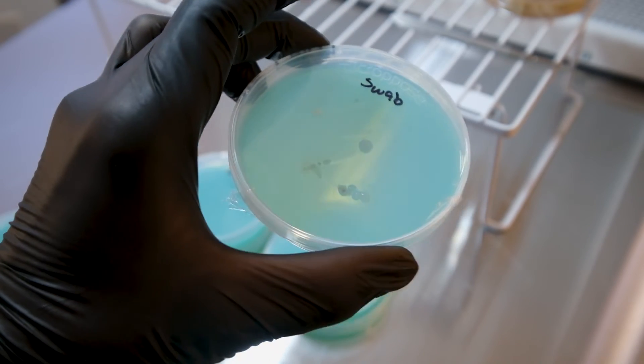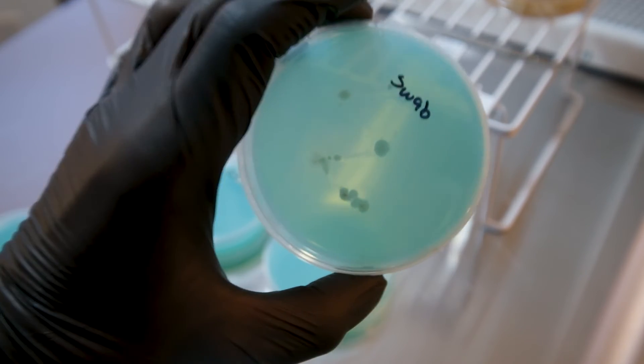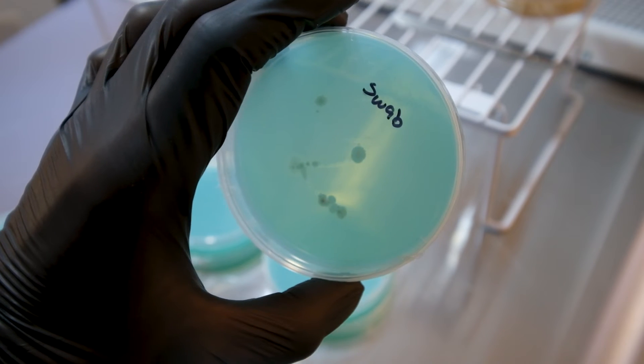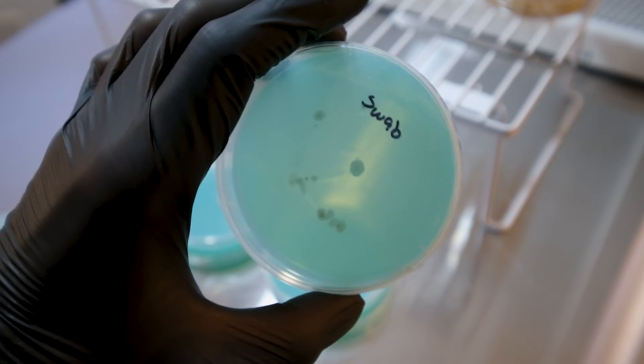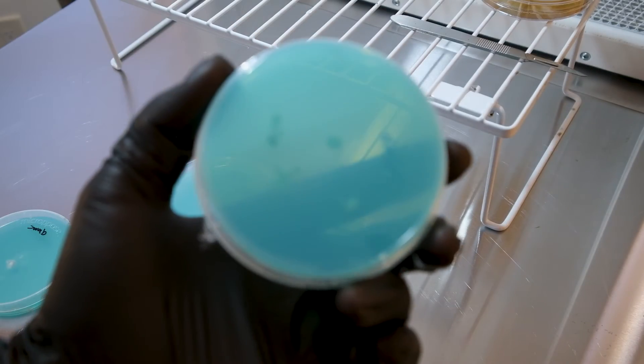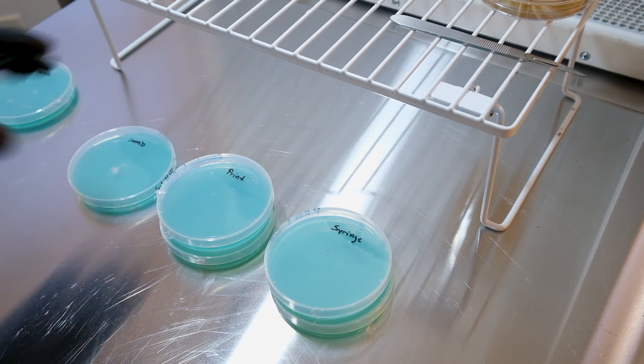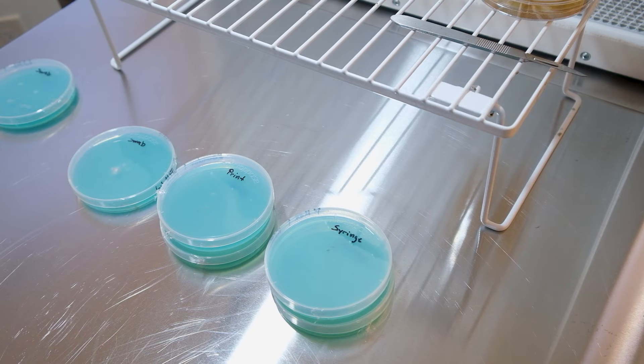That plate is all contaminated — this is why we use agar. If this had been a syringe and I had put this right to grain, the whole bag would have contaminated, it would have been a complete loss. But now we know this is junk and we can throw it in the trash. Five out of six ain't bad, and all of them germinated.